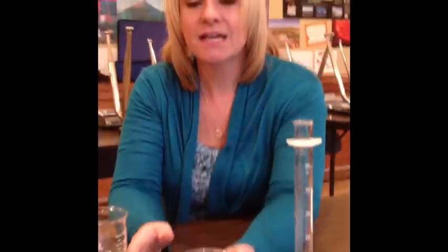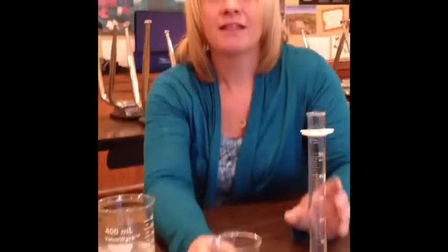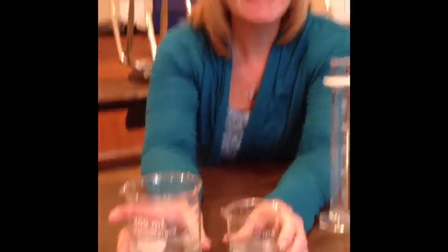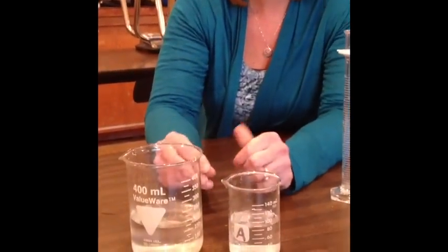So I have water. This, see this one? This is called a beaker. So is this. Beaker. Can you say beaker? B-E-A-K-E-R. Beaker. Beakers hold liquids but don't measure accurately.